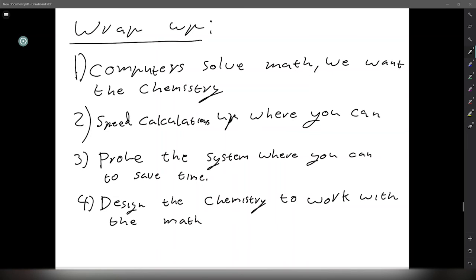Also, just make sure that the chemical data is good. These methods can work well in optimizing when the chemical data isn't good, but it will bias the data, or the computer will try and compensate for it where it can. And that compensation can lead to really odd parameter values. So where possible, make sure that you can change the experimental design to make more valid sense.